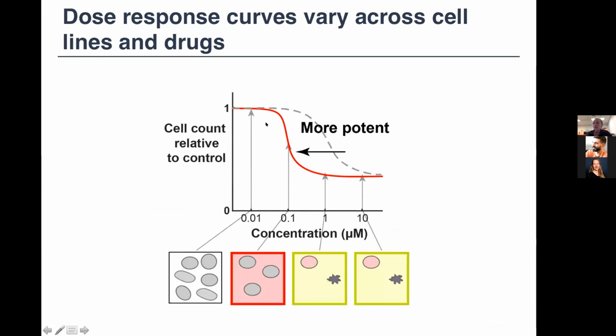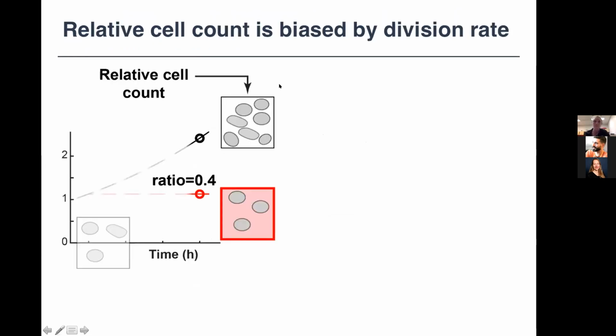You can then collect similar responses, either for many drugs or many cell lines, and start to collect data on which are more potent or more sensitive, depending on what is interesting biology for your project or your context.